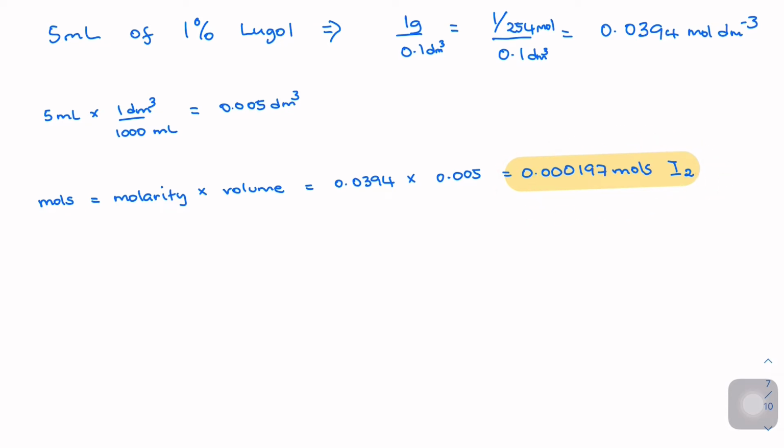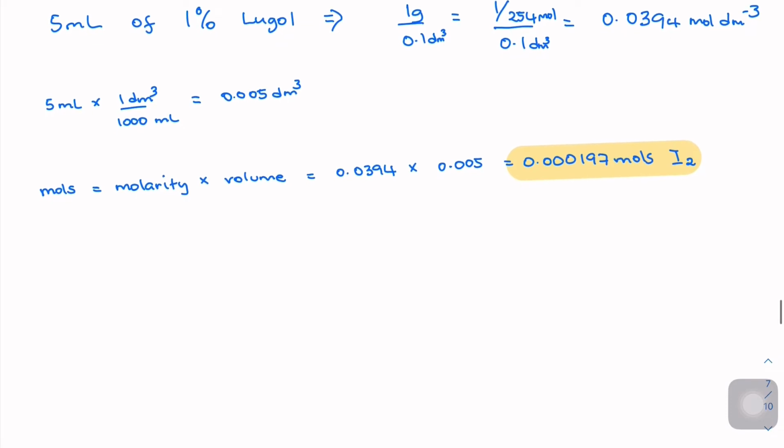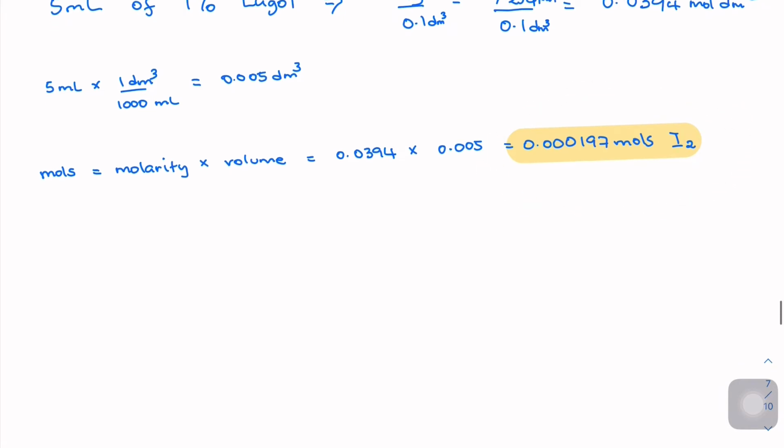So our iodine is going to react with caffeine. Some of the iodine is going to react with caffeine, but there'll be extras, and that's what we're gonna figure out using the titration. So the initial amount that we added, here we go. These are the moles.